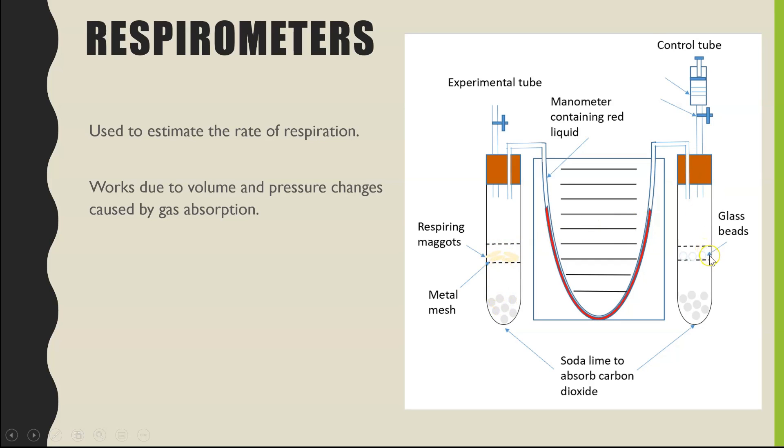Our control tube exactly the same, except if we want to prove that it's definitely the organism that is respiring and nothing else causing the changes, then we need to put an inert object. So we've got glass beads here as an example because they won't be respiring, but you'd put the same mass of glass beads in as maggots just to keep everything consistent.